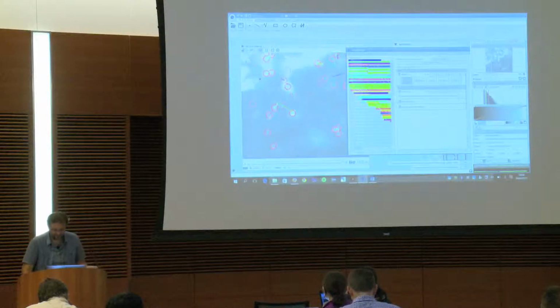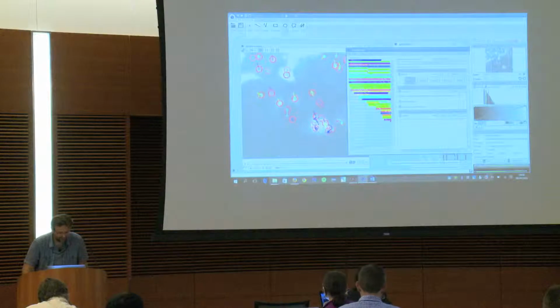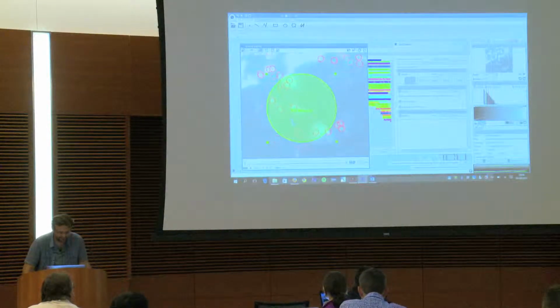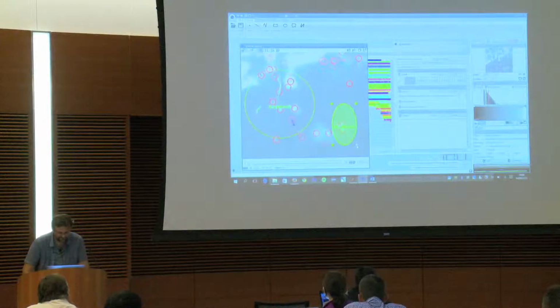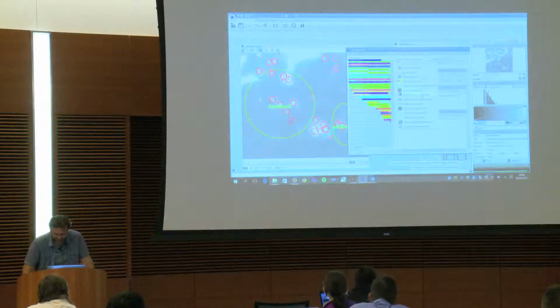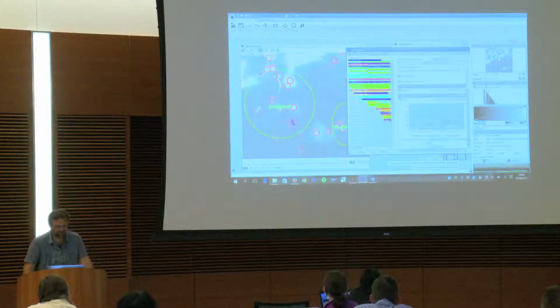And now over this, let's say I want to place a gate with a ROI, so that I only see what is in the ROI, but I can have a number of them. I want to see what is here, but that's all. And now I want to know the speed. And I have this thing here, but it's only showing the speed of what is currently seen.